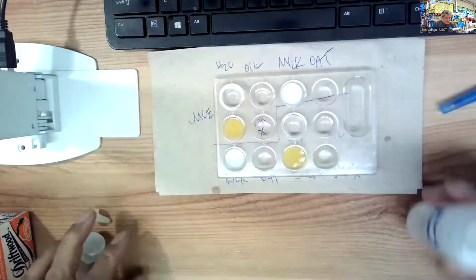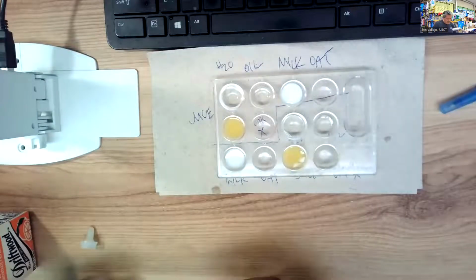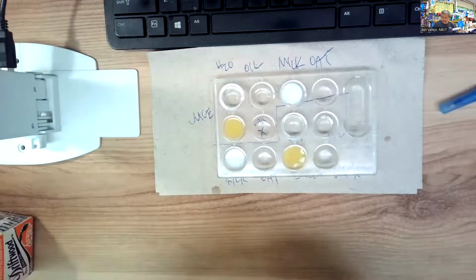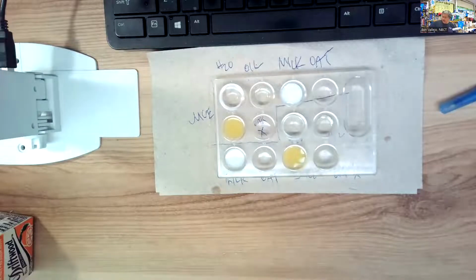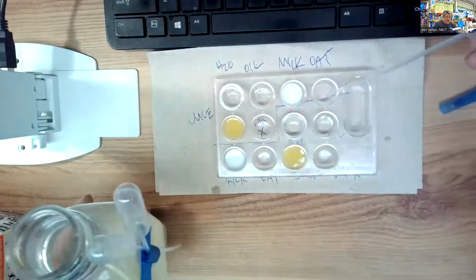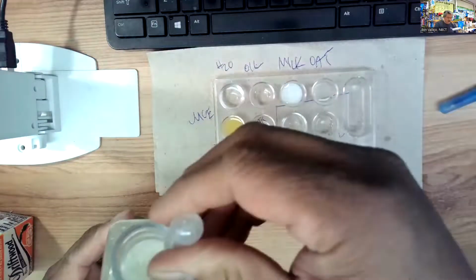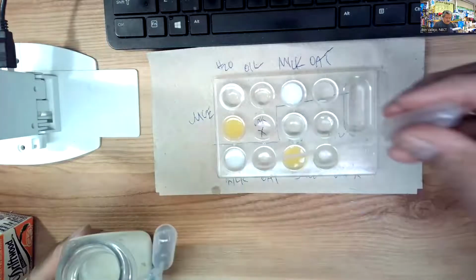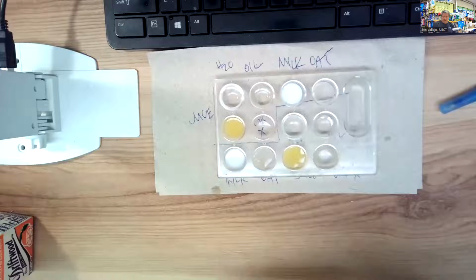So now I've got water, oil, milk, juice. I need my oatmeal solution and my unknowns. So get that oatmeal bottle. Here it is, oatmeal. Take that, put the oatmeal in there, and mix that up a little bit. The oatmeal in there. Okay.